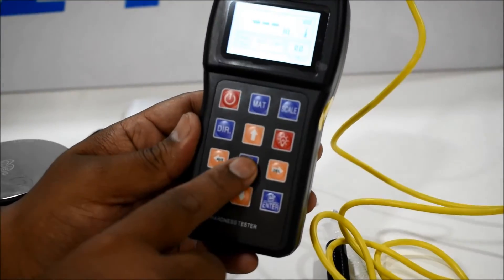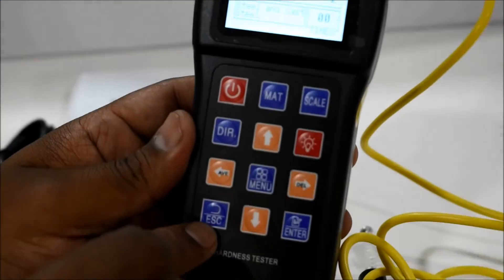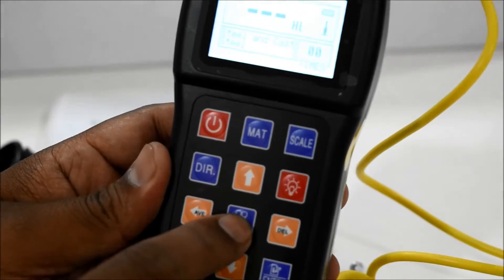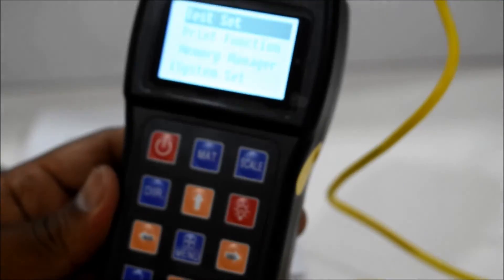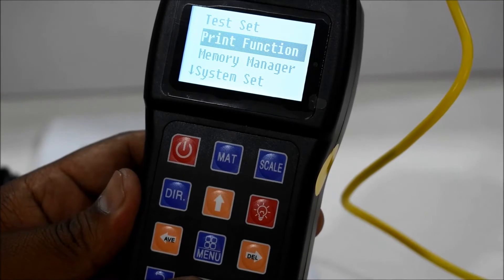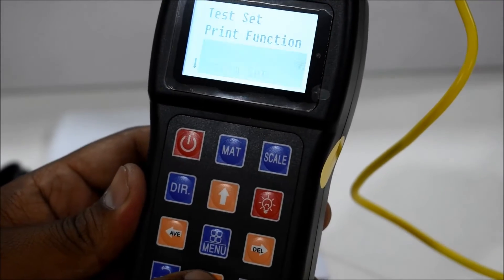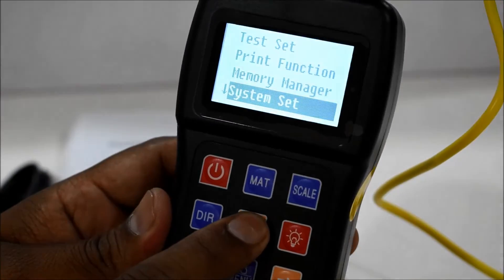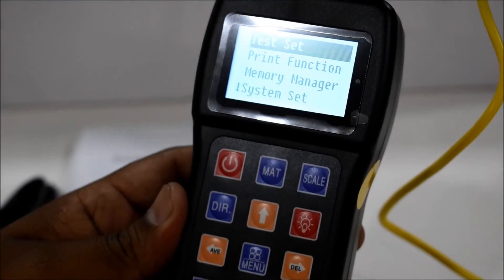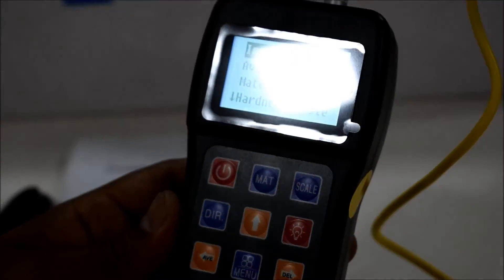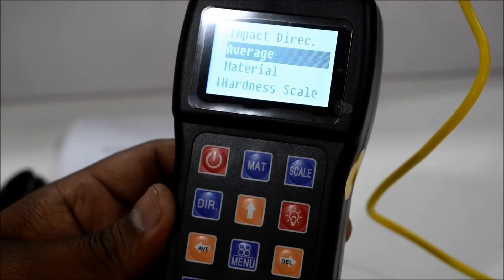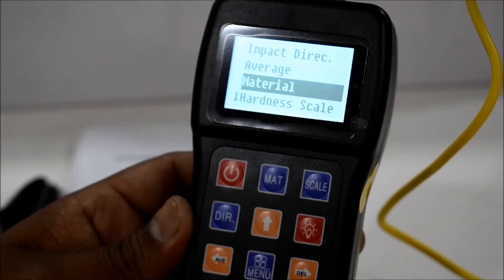There's an enter button and escape button, then the middle button is the menu button. The printer function, memory manager, and system set are available. In test set, the impact direction is already given to outside. Select average and material.